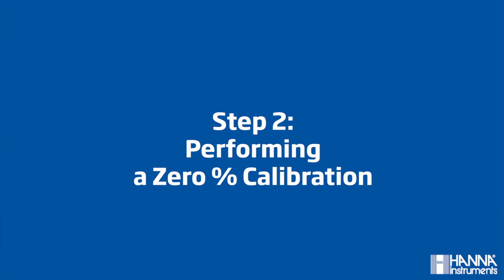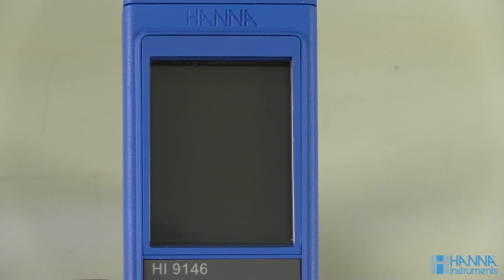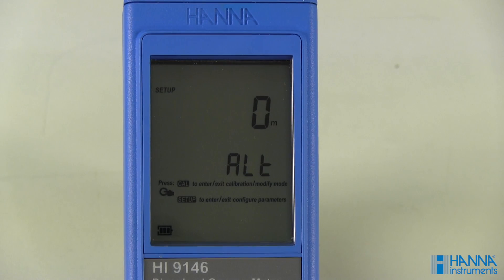Step 2: Performing a 0% calibration. Make sure the meter is on and the probe is properly polarized. Set your appropriate altitude factor. Make sure the salinity factor is set to 0.